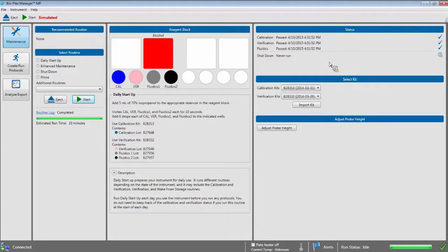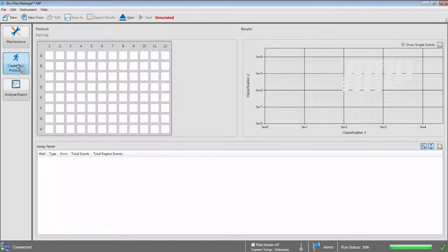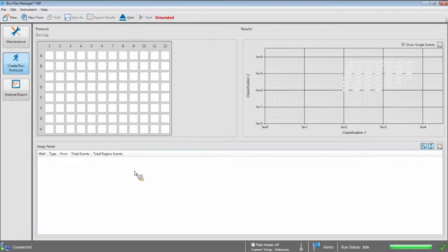The next step is to set up your run protocol. You can set up your run protocol while the maintenance routines are running, or once they have finished. You can also set up a protocol while the MagPix is offline and save it to run later. To create your protocol, click on the Run Create Protocols button on the left side of the screen. In this window, you will see three main sections: the plate setup, which shows which wells the MagPix will collect data from and the sample type in each; the bead map, which shows the bead region selected in the assay; and the assay panel, which lists the data results as they are collected.